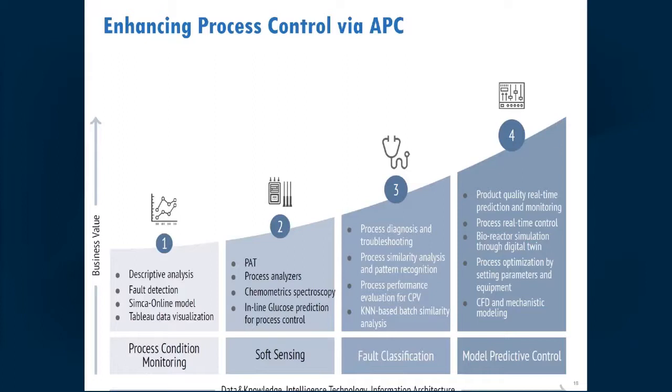Interestingly, this pattern recognition, we've been working on it for a while. In fact, I had been talking about this in a couple of mass spec meetings, where we're looking at complex spectra and conducting pattern recognition on that, to start looking at what the impact on product quality would be. This has been going on for probably at least the last 15 years or so. And then eventually the last stage is predictive control. The hesitation in some cases with online analysis has been, how long do you keep doing that? The idea is that you don't just continue on. You start with the testing and then gradually move to other modes of predictive control, so it doesn't all have to be around testing. And that's where we are as well.